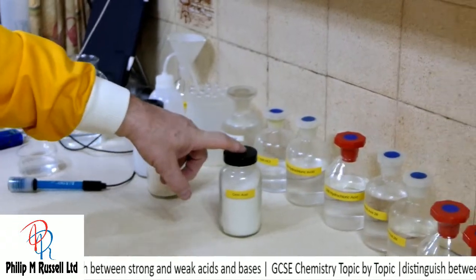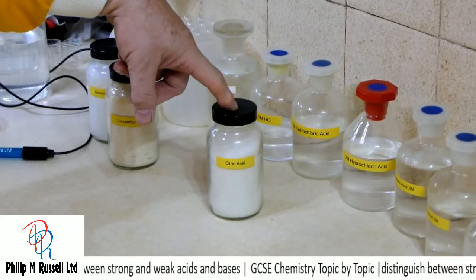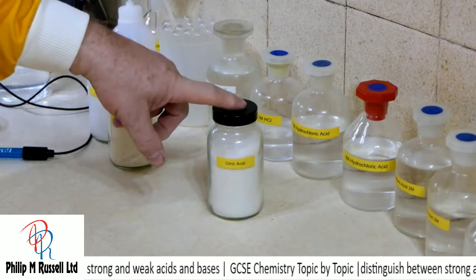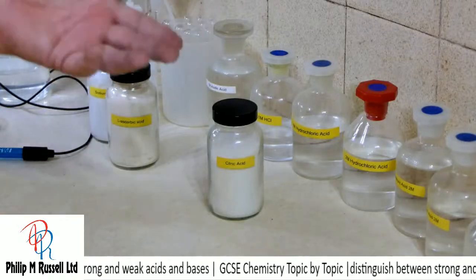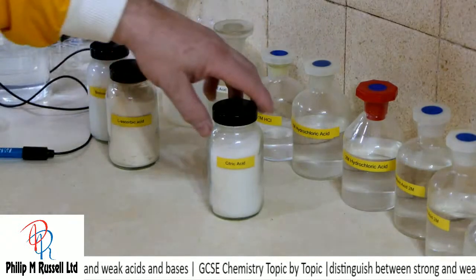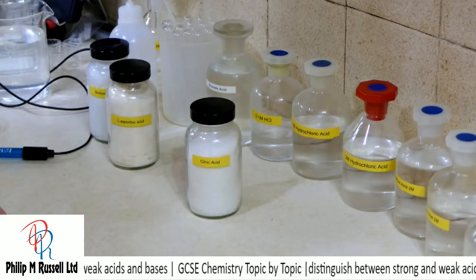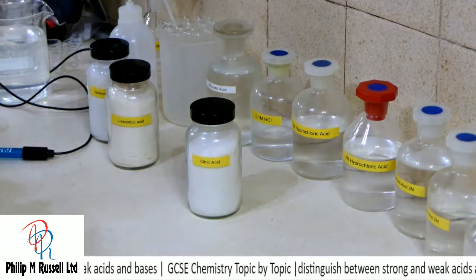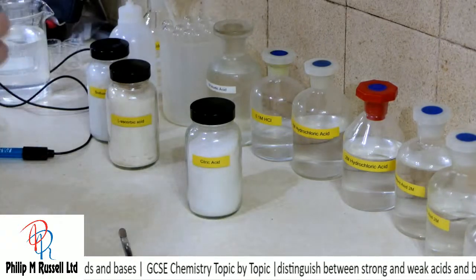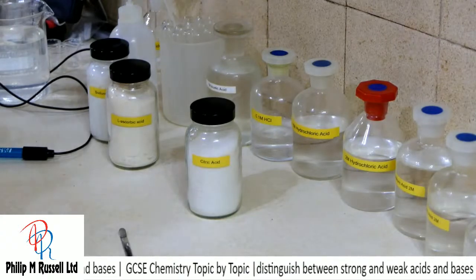So if I put some universal indicator paper in here, we find that nothing happens. I'm not even going to bother doing it really, because if I just put it in there and leave it, just like my finger, nothing happens. And it takes a while for nothing to happen, so I'm not going to do this. But what I will do is take a small sample of citric acid and put it into a test tube.